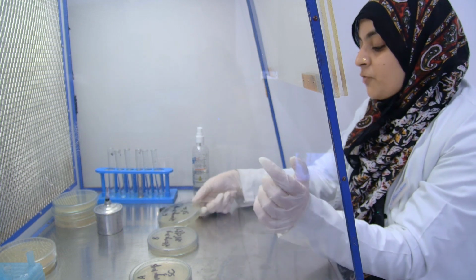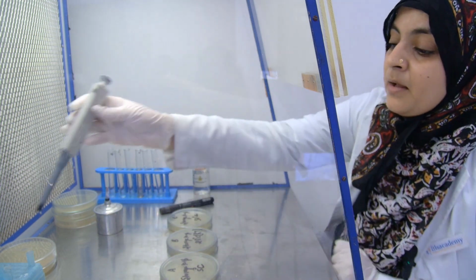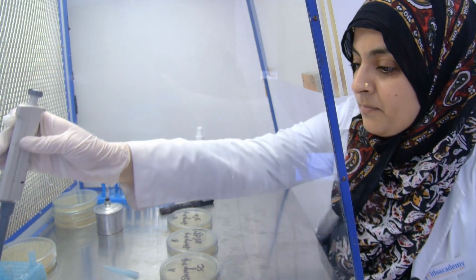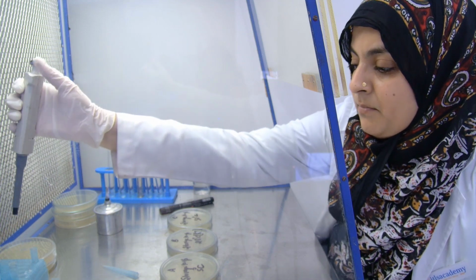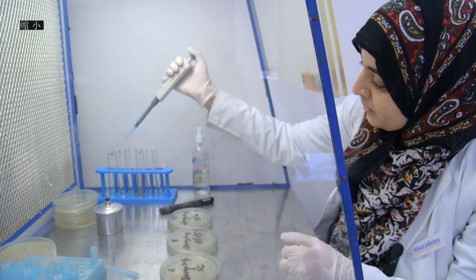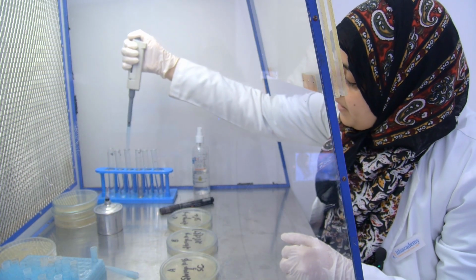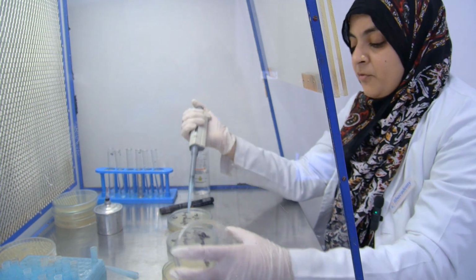Okay, now first of all, what we have to do, we have to inoculate this. Now we take a 10 to the power 3 dilution, put it into the first Petri plate.